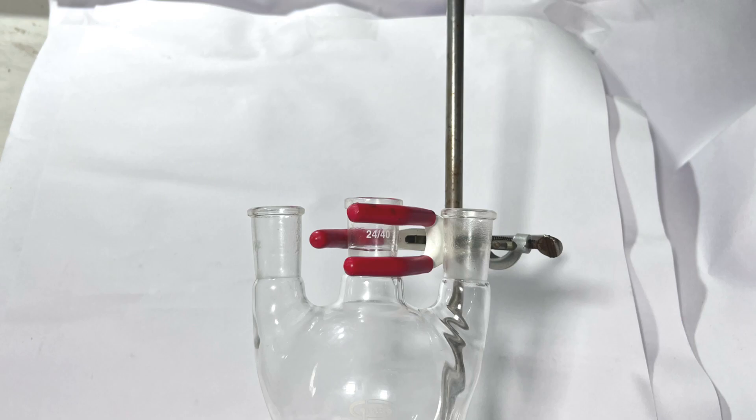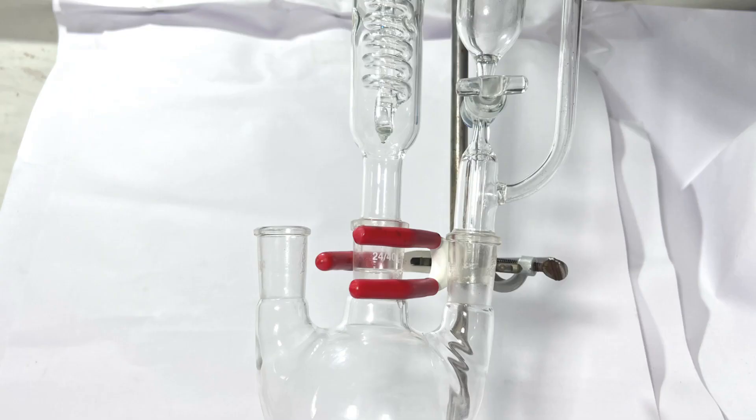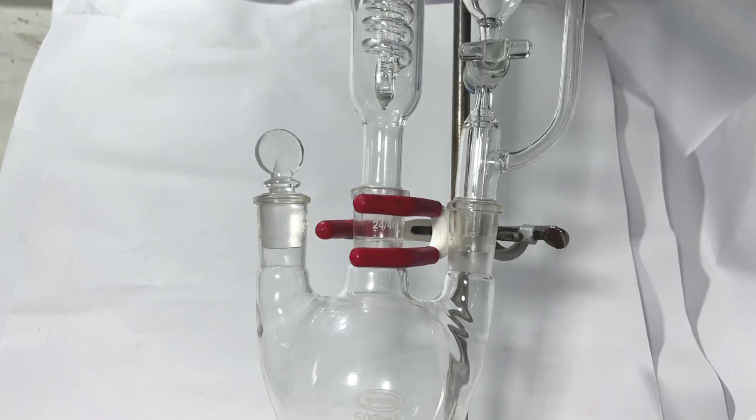A pressure equalizing addition funnel was attached to one of the side necks. A Dimroth condenser was attached to the center neck and a penny head stopper was placed on the other neck.